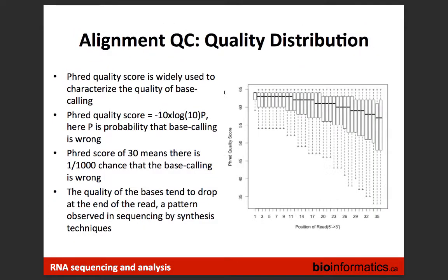Quality distribution: looking at each base position within a 35-base read, compiled across all reads in the library, using PHRED scores. PHRED score is negative log10 of the probability that base calling is wrong. A Q30 score means a one-in-a-thousand chance of error — Q30 is generally the threshold for acceptable quality. If you see bases below Q30, you can trim those bases, and many trimming tools let you specify a minimum Q-value rather than a fixed number of bases to trim.